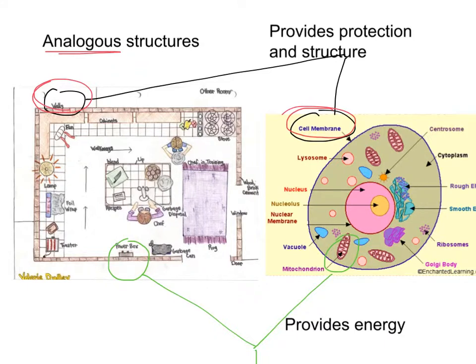So what I want you to do is to put the two pictures of the two different setups side by side. And you can pull a picture from the internet for fractional distillation of crude oil. You want to pick one that's simple and easy to work with and doesn't have too much writing on it. And you can pull a picture from the tutorial that I did on fractional distillation. You can just take a snapshot and put the two things side by side.